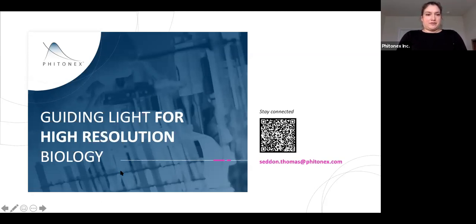All right, so we have another question. The data we showed was generated on which cytometry platform? Good question. We had different platforms. At the beginning, when I was showing you the NIH data, that was generated on the Symphony, which is a BD, very large instrument that has a large number of lasers and detectors, but is still a conventional cytometer.